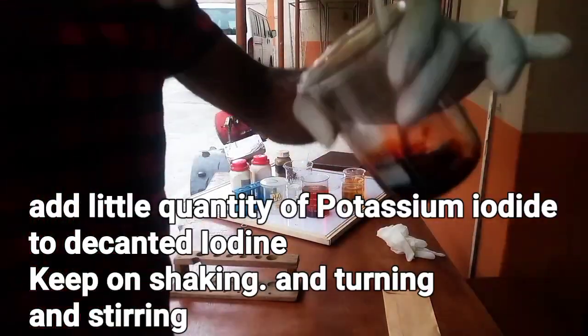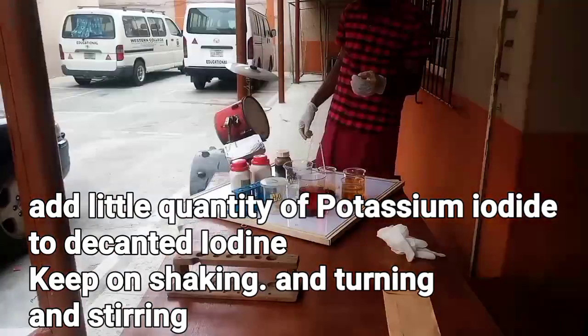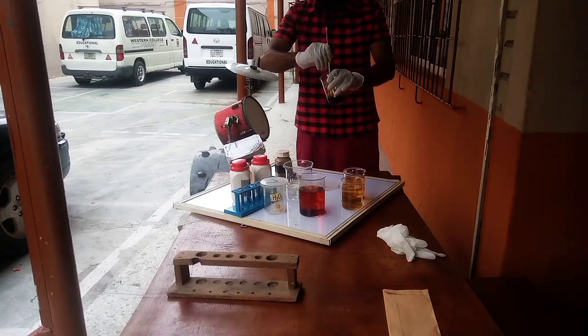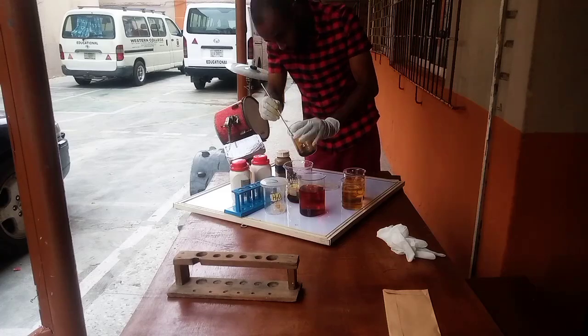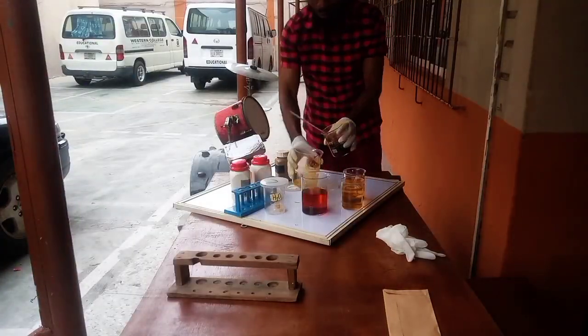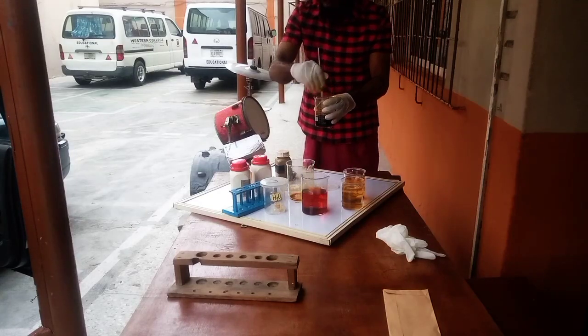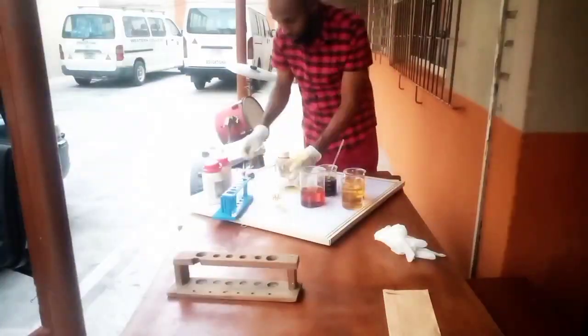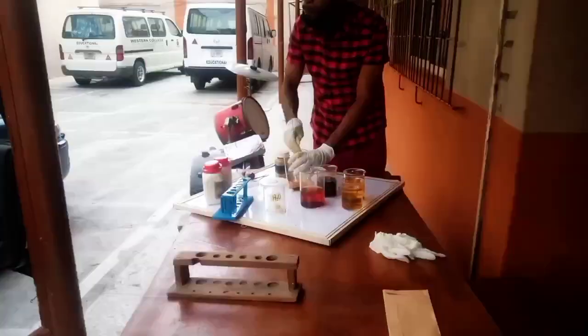By the theoretical aspect, it's supposed to be more than 6 grams. You will understand it if you watch my possible questions from WAEC, what they can actually give us on the practical day. I actually did a strong work over here trying to dissolve this. Therefore, I'm going to fast forward this from here so that this video will not take much longer. Just bear with me on that.